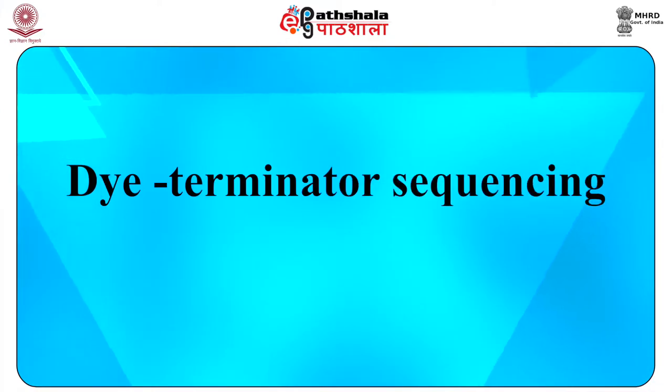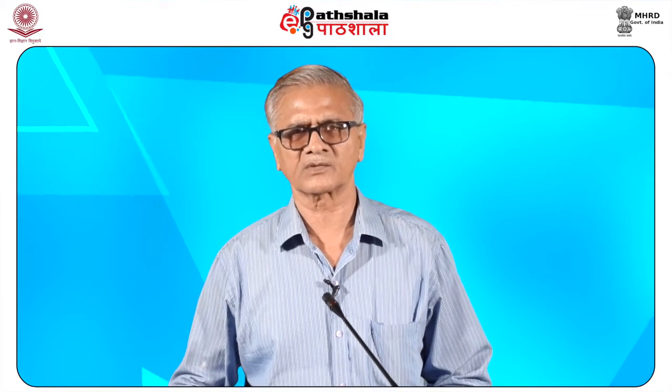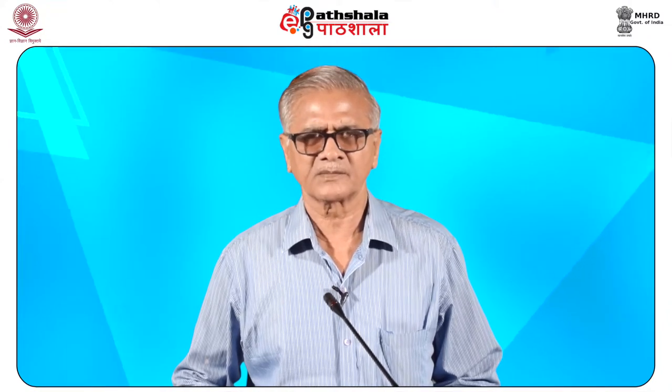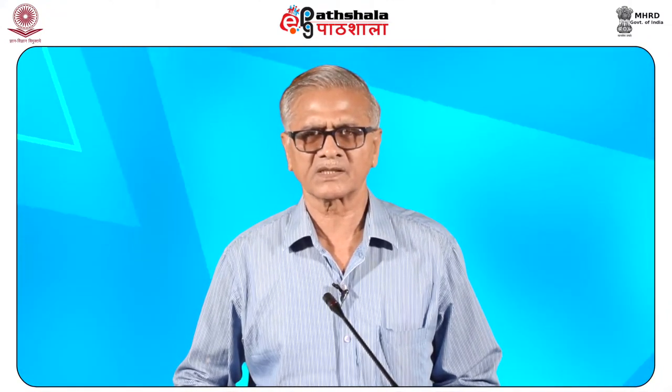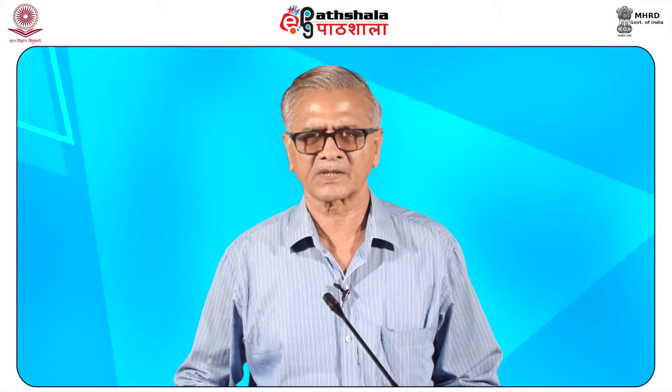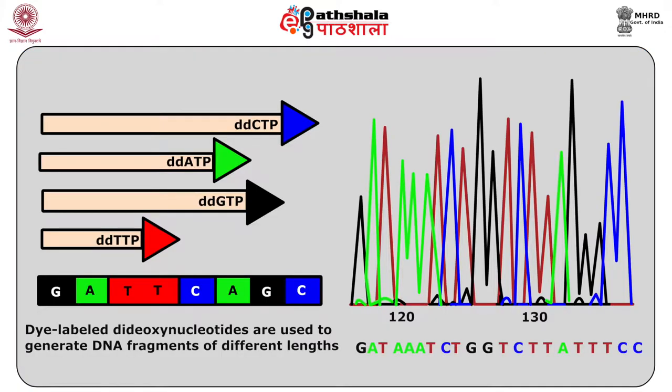The next method is dye terminator sequencing. Dye terminator sequencing utilizes labeling of the chain terminator dideoxynucleotides, which permits sequencing in a single reaction rather than using four reactions as in the labeled primer method. Each of the four dideoxynucleotide chain terminators is labeled with a fluorescent dye, each with a different wavelength of fluorescence and emission. Fluorescent labeled dideoxynucleotides generate DNA fragments that terminate at each nucleotide along the template strand.